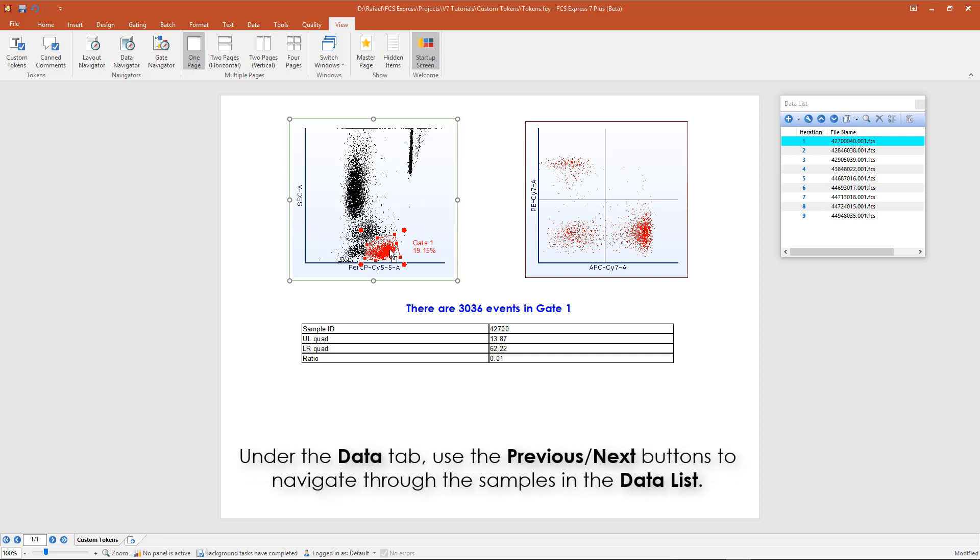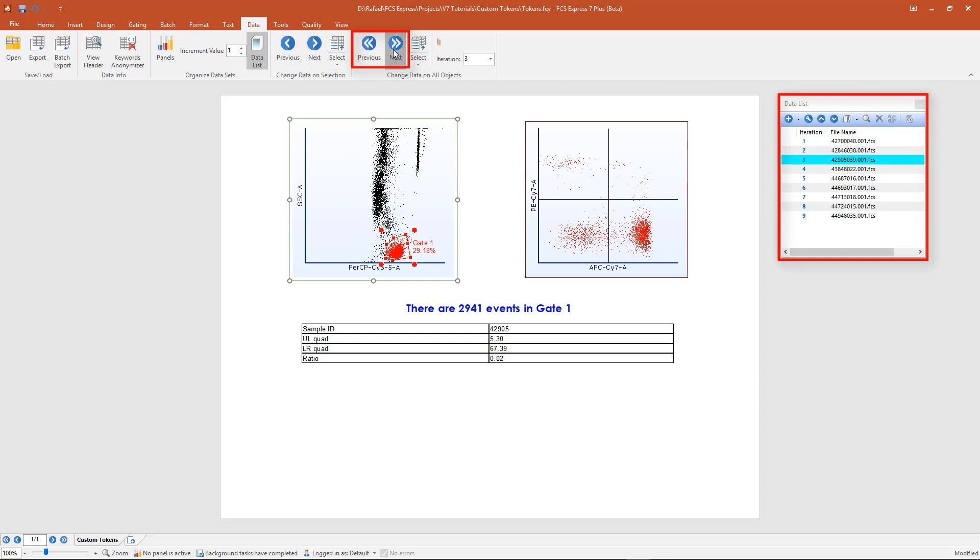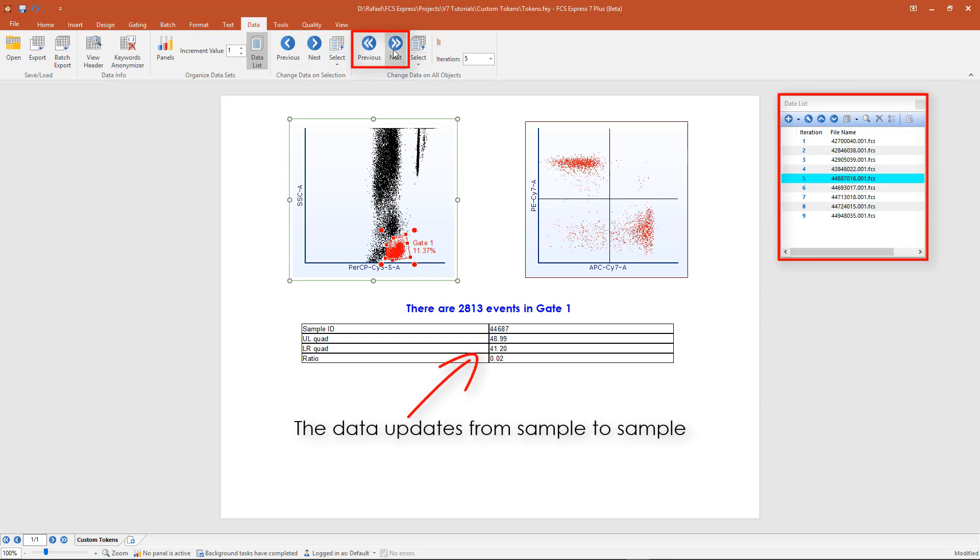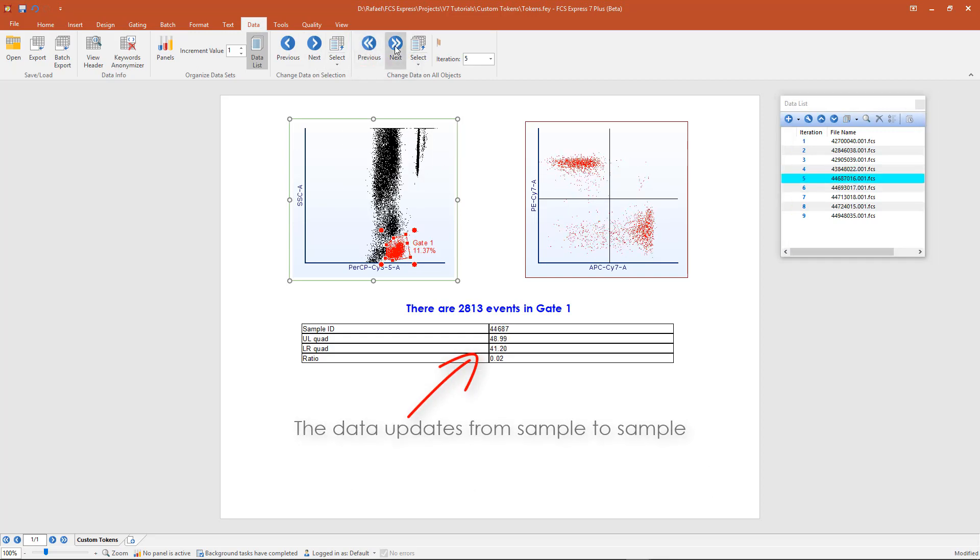From the Data tab, use the next or previous buttons to navigate through your sample within the data list. As you navigate between your samples, the data automatically updates.